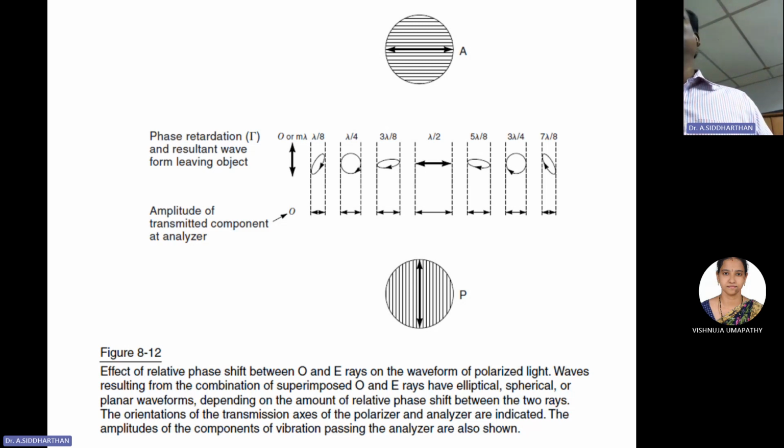That is the first step to know whether your material is responding to polarization. If a material is not responding to polarized light, there is no use of putting that material in a polarization microscope. So only metallic systems which are non-cubic, such as hexagonal HCP structures and tetragonal structures, can be put in your microscope and seen.